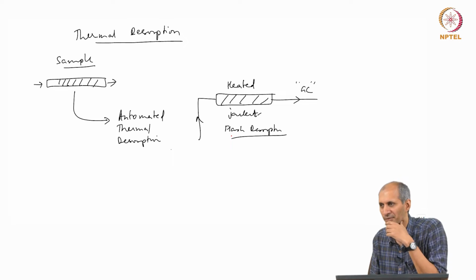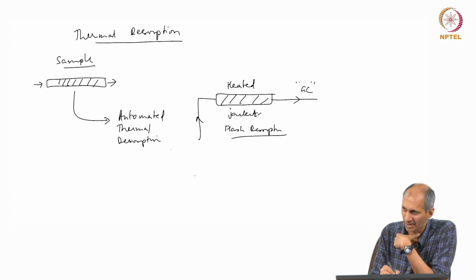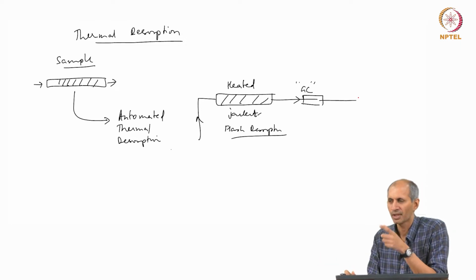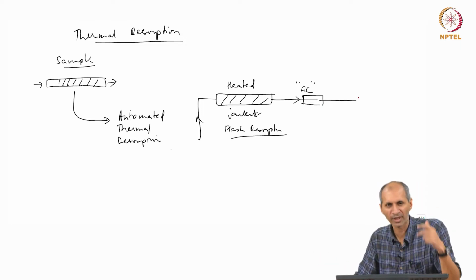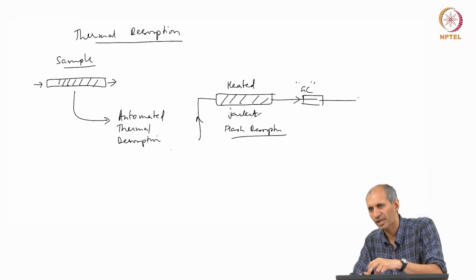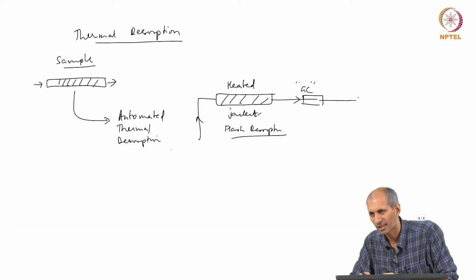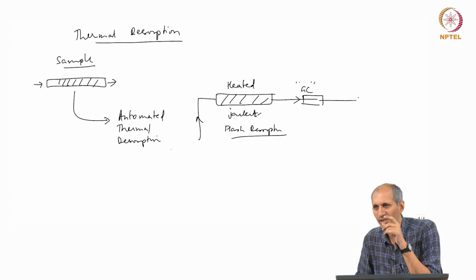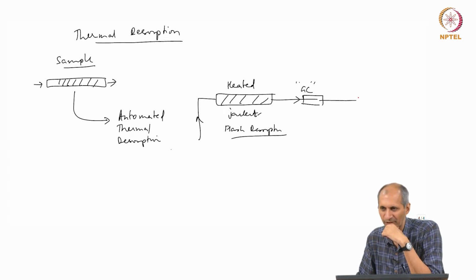Why do you want all of it to come at once? Because when you send a gas to sweep everything out, you want the volume of the sample to be as small as possible, because now you are going to inject it into a GC. If you recall the GC, our injection is very quick, we are injecting a pulse there. So, we want it to be as close as possible to a pulse, otherwise separations will have a problem. In sample injection, your chromatography retention time will change and all that. So, it is very difficult to manage it, and to the extent possible they try to do this as quickly as possible.